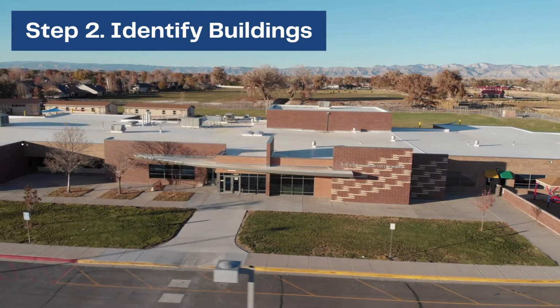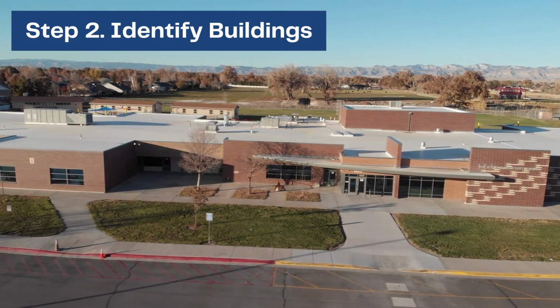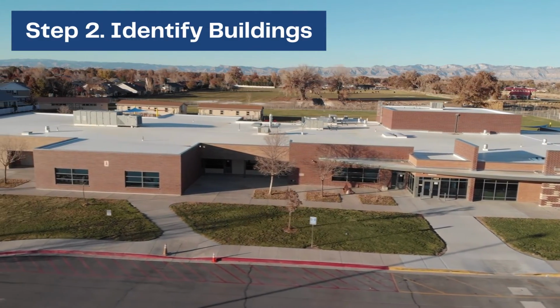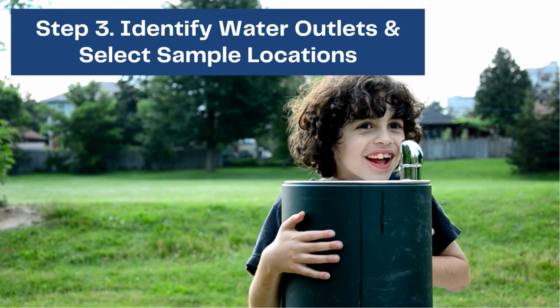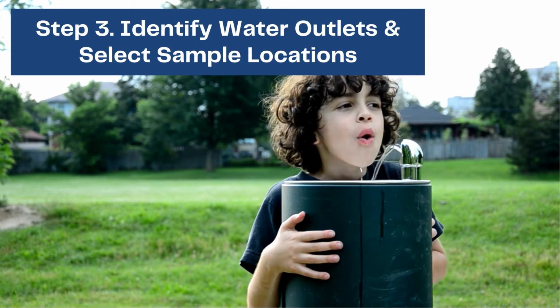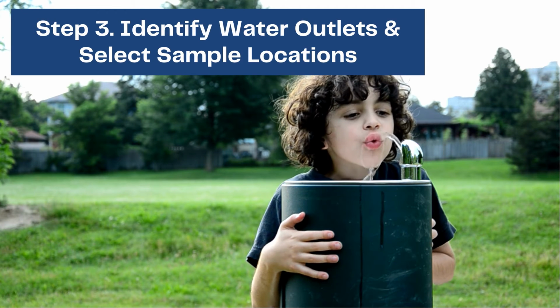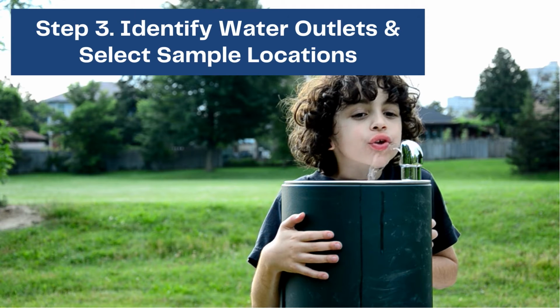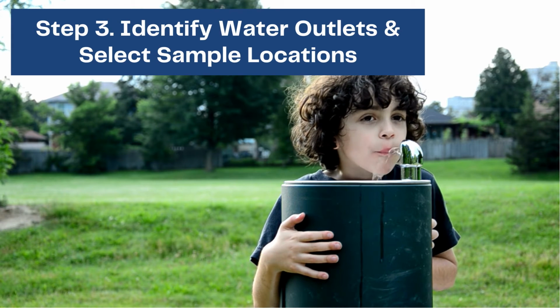Step 2. Does your facility have multiple buildings? If so, identify which buildings serve younger children aged 6 and under. Step 3. Identify water outlets and select sample locations. It can be useful to mark all water outlets on your map, but only locations used for drinking or cooking should be sampled. Which fixtures are used daily for drinking or food prep?